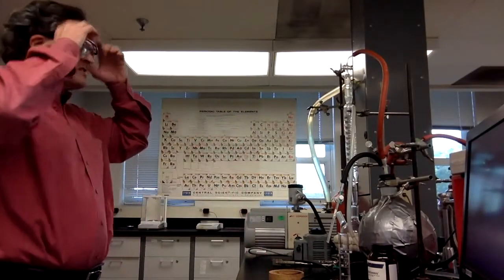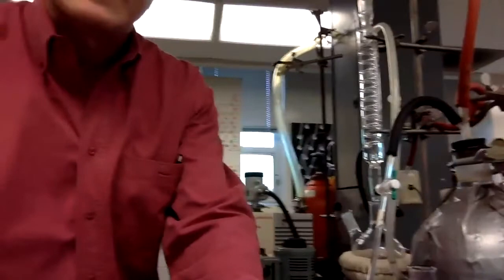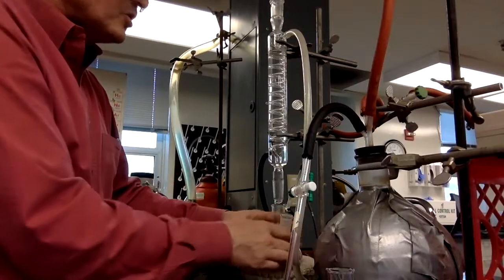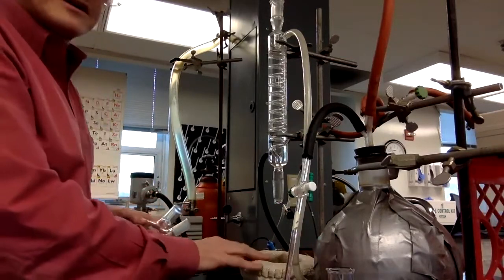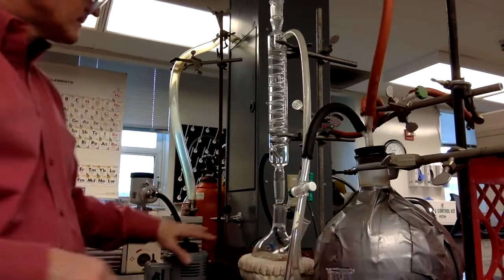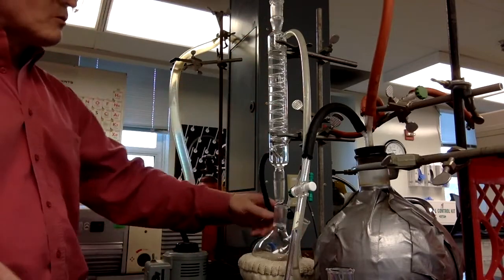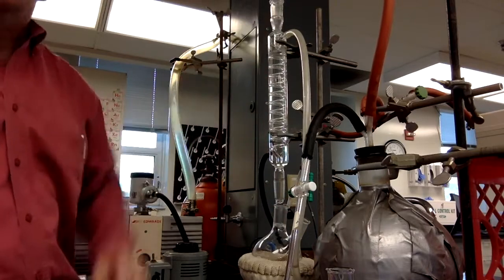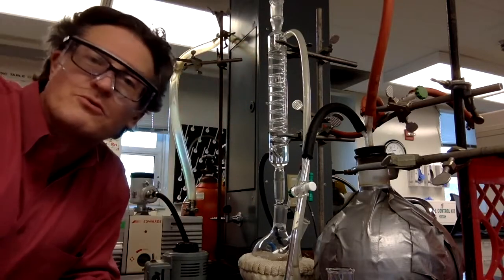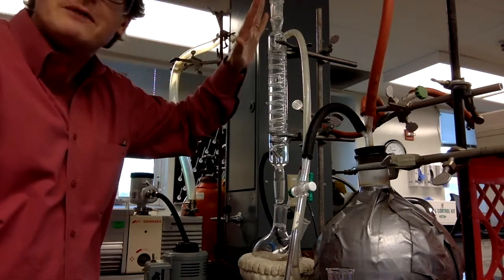So how are we going to do that? You have probably used a distillation apparatus before, and this is a distillation apparatus. We've got a 2-prong round bottom flask, and the heating mantle down there is hooked up to the variac, so we can control the power. Then we've got a condenser here. Water comes in from the bottom and goes out through the top. It's important that it goes in through the bottom and out through the top so that you get nice flow up through there. You probably had that open at the top when you did it in organic.